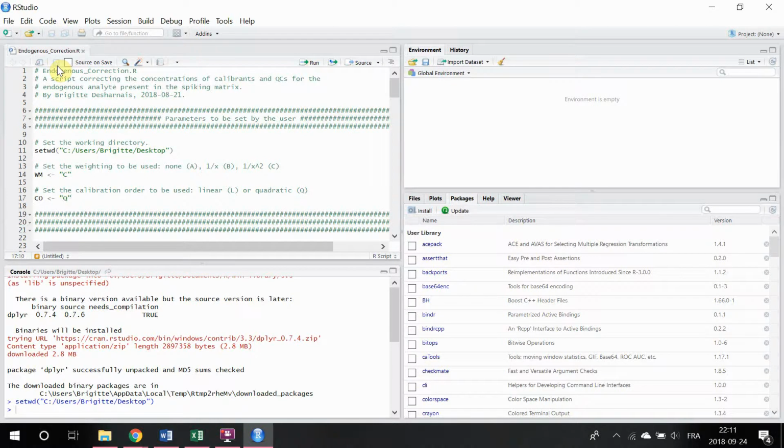So I'll give you an example of how this works with a BHP dataset we've acquired on an LC-MS system. Unfortunately, since I can't record this on the laboratory's computers, IT rules oblige, I will not be able to show you how to treat the data in the real software. I'll show you a dataset copied straight from Multiquant, but in an Excel spreadsheet.